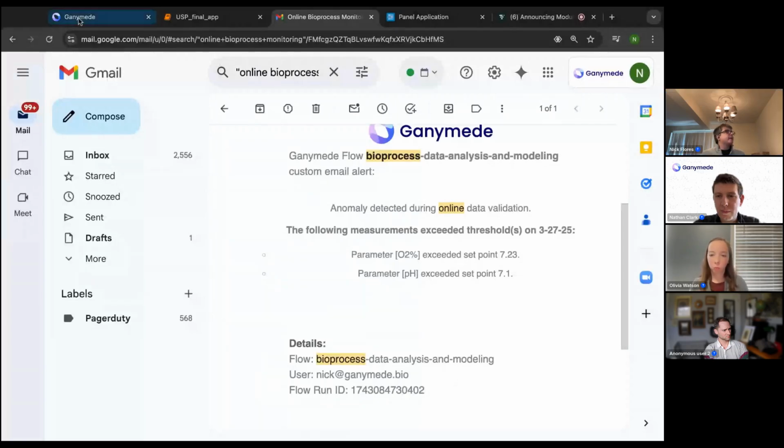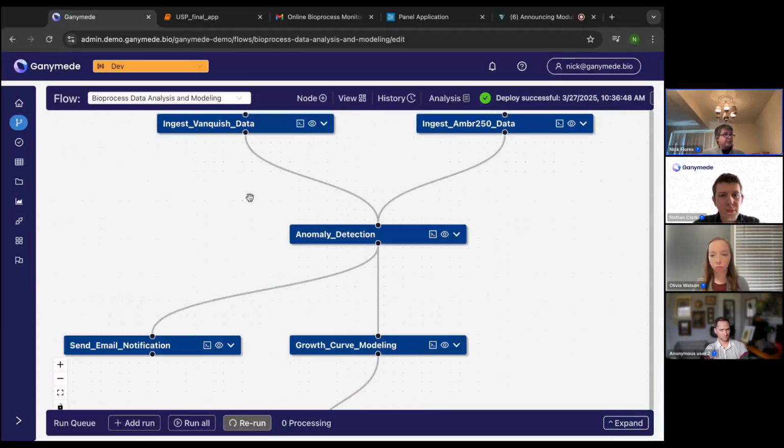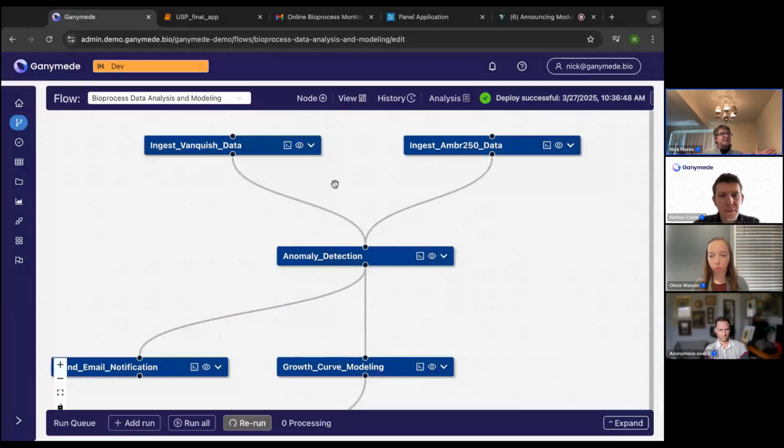Okay, so that was a very fast, I know, brief explanation of agents and flows. And really these two concepts together are how we automate our data analysis. But like Nathan said, there's often times when you need to leverage specific scientific expertise to modify an analysis, or like you said, maybe to just approve it to say, yes, this looks good.